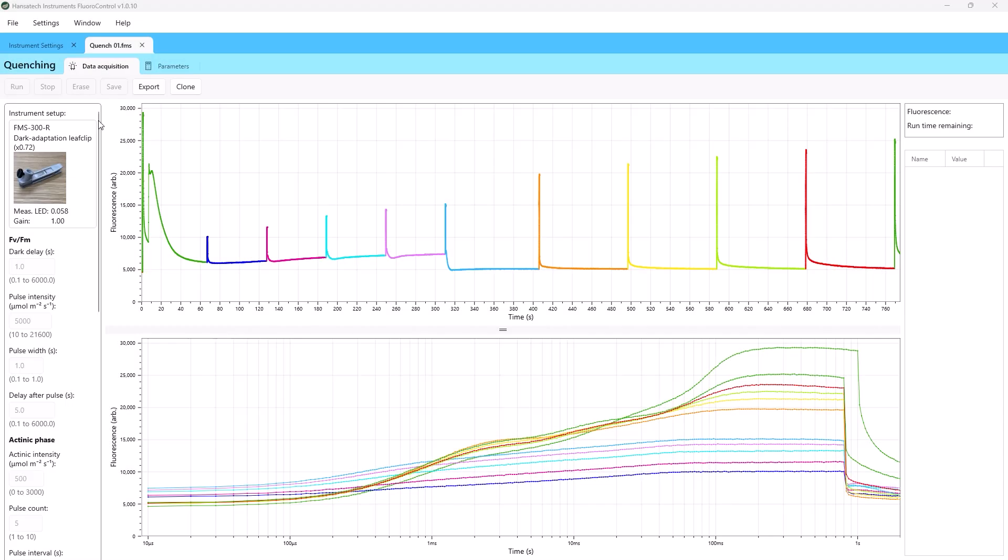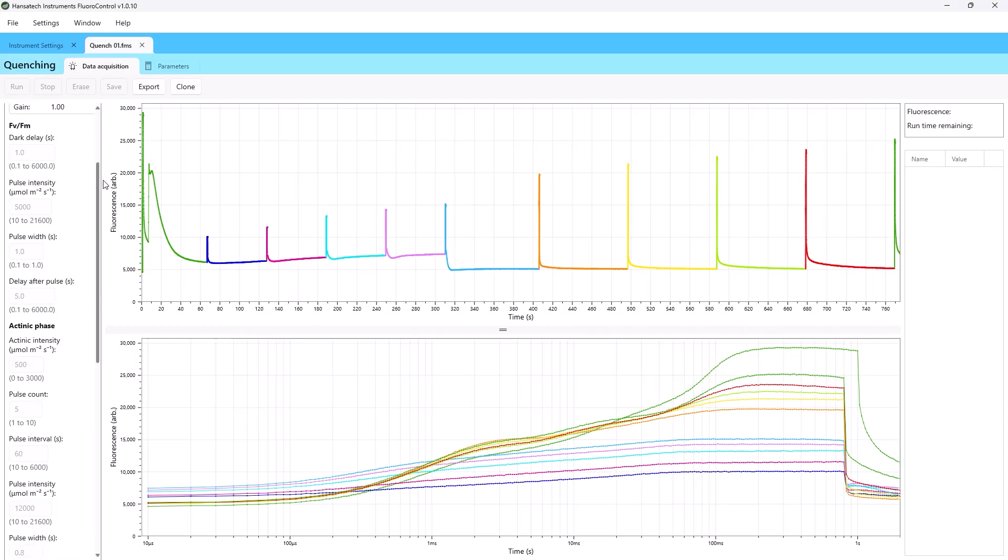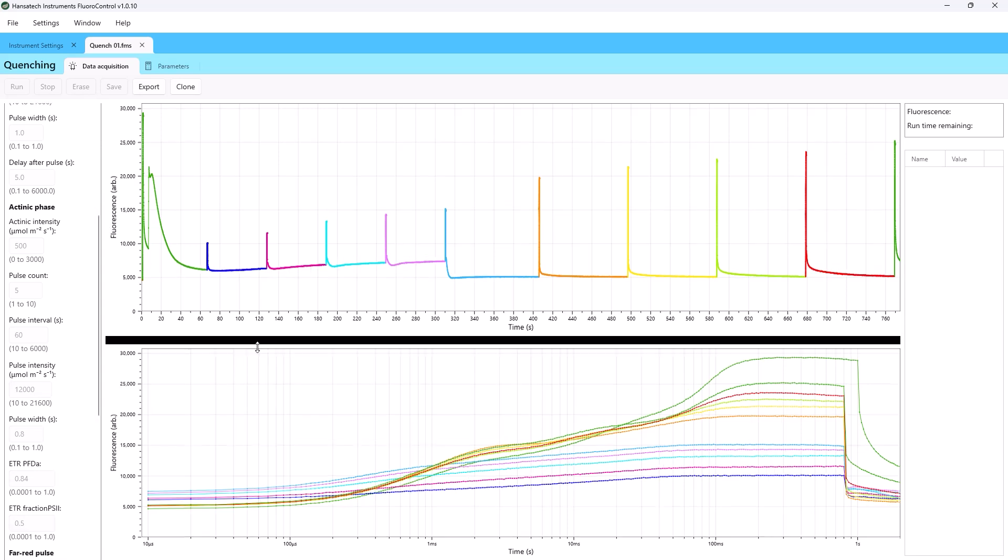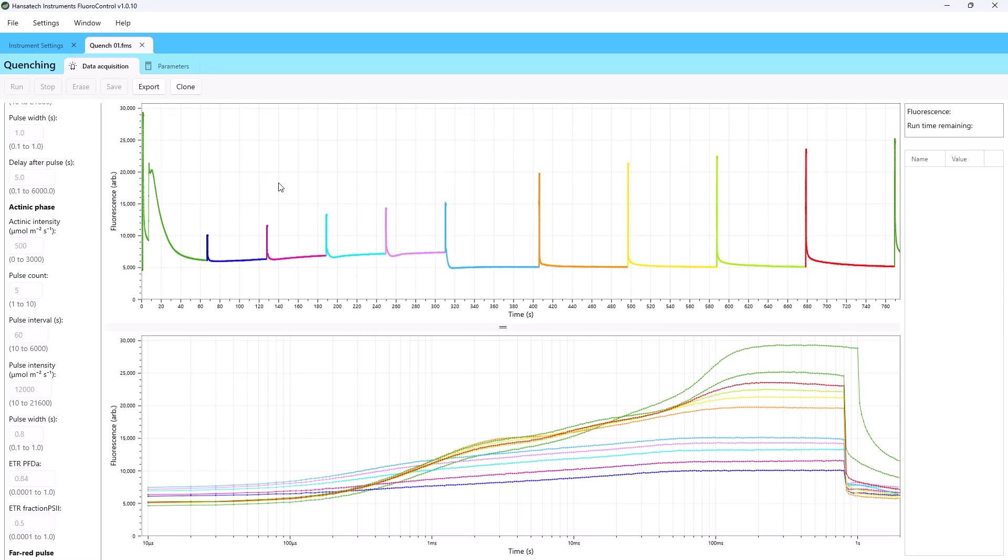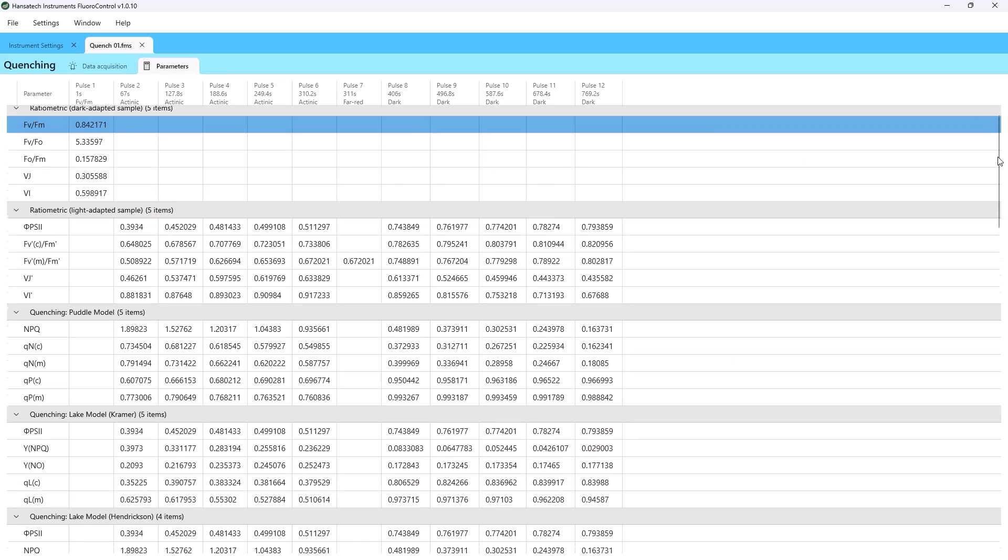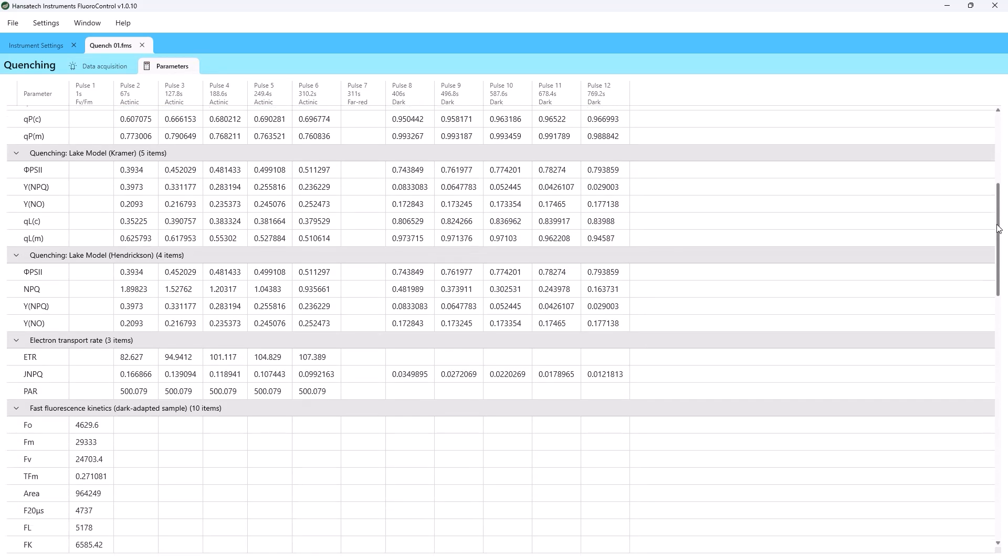Saved results files show all your configurations, your graphed data and full parameter analysis, which can all be exported with the raw data to CSV format.